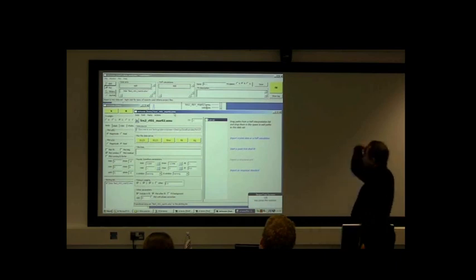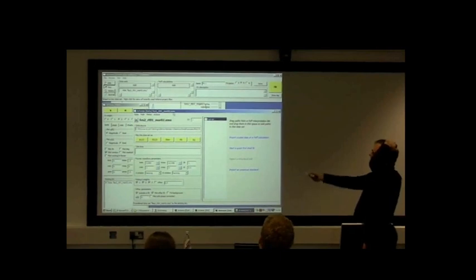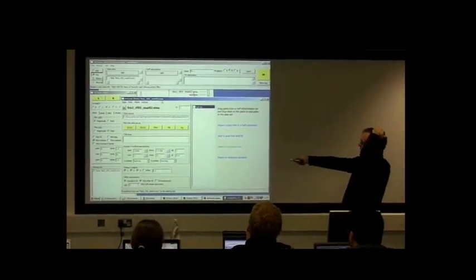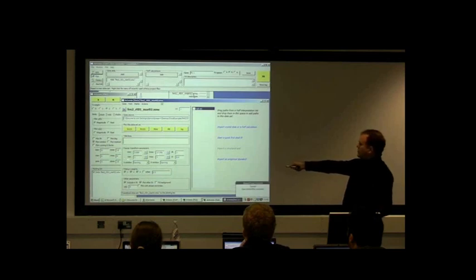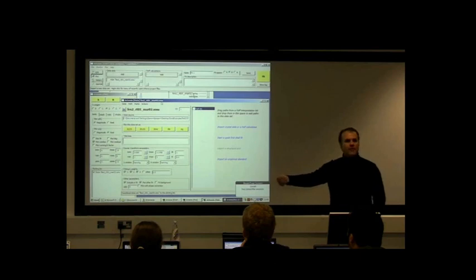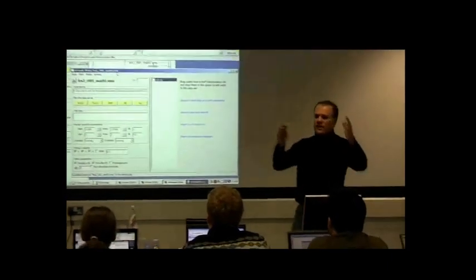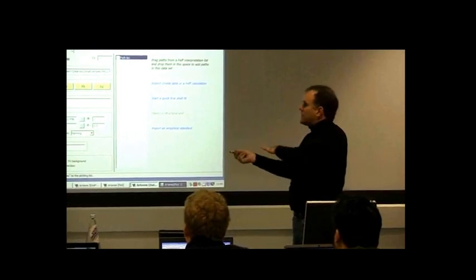All right. So on the one side, you have all of the parameters that are going to be used to describe the data. And it turns out that these values for the Fourier transform range and Rmin and Rmax, all of these things were all imported from the Athena project file. So if you had worked on your data to the point where you had the Fourier transform range and other things just so, they get preserved. That is, they get read from the Athena project file into here.